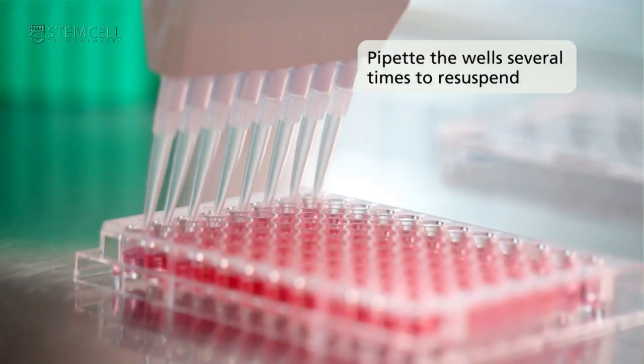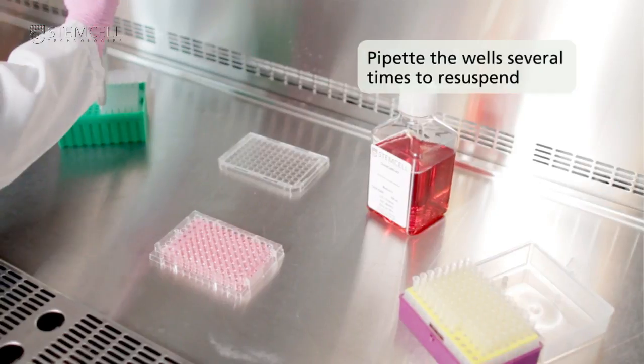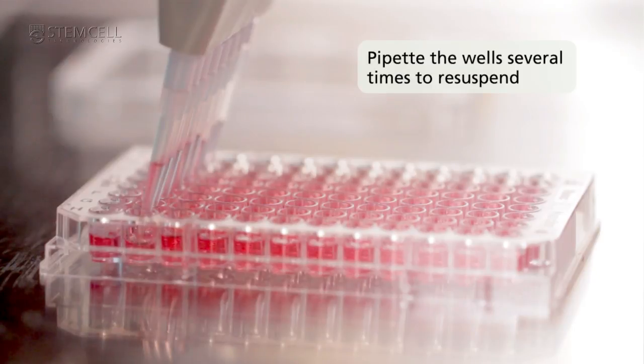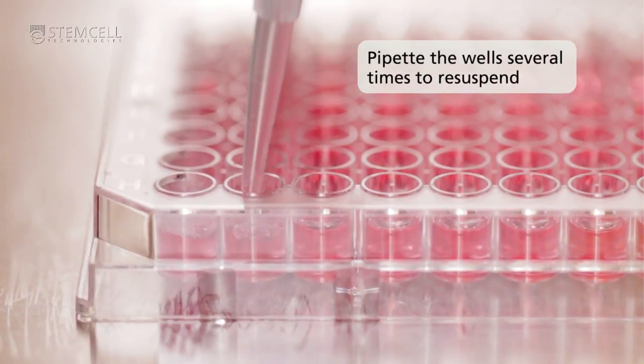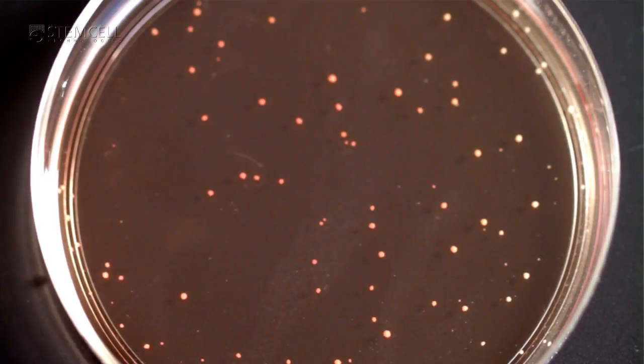Pipette the contents of the wells several times to resuspend the colonies. A single cell suspension is not required, but gently dispersing the colony will promote cell proliferation. Colonies of different sizes should be selected. Slower growing clones are often very good at producing antibodies. Grow cells for approximately 4 days and screen for specific antibodies using appropriate screening assays.